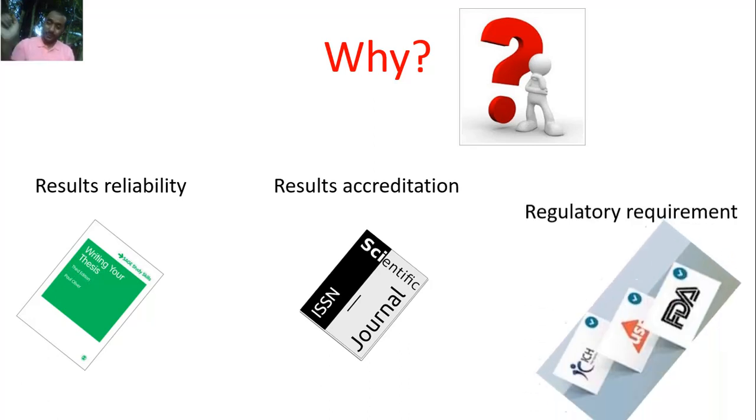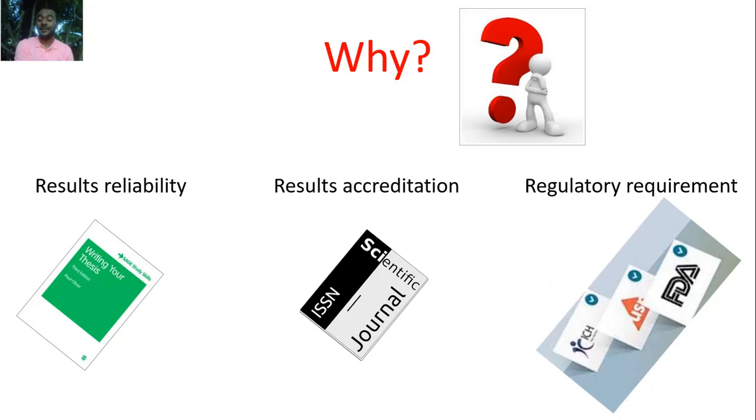Number 3, if you are dealing with official bodies, you need to let them know that the method that you used to do the in vitro and in vivo studies, the bioequivalence studies, is reliable and valid for the intended purpose. So it looks like analytical method validation is really important in pharmaceutical work and in all chemistry actually.